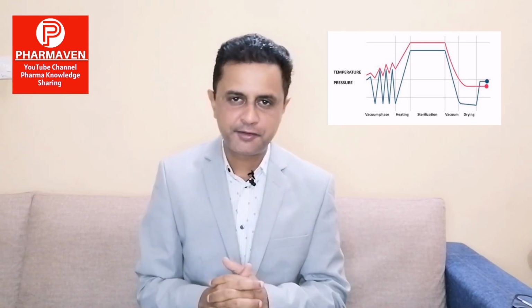If there is a certain issue, for example, at a specific location there is a BI failure and the temperature in that specific sensor has fluctuated, then we can correlate that this temperature fluctuation may have led to not achieving the appropriate BI destruction completely. So just check these parameters. Also check the entire cycle against maybe 5 previous good cycles, or the previous requalification. If it is a requalification cycle, then check with the previous requalification whether it is meeting the same requalification criteria, whether the cycle is comparable.